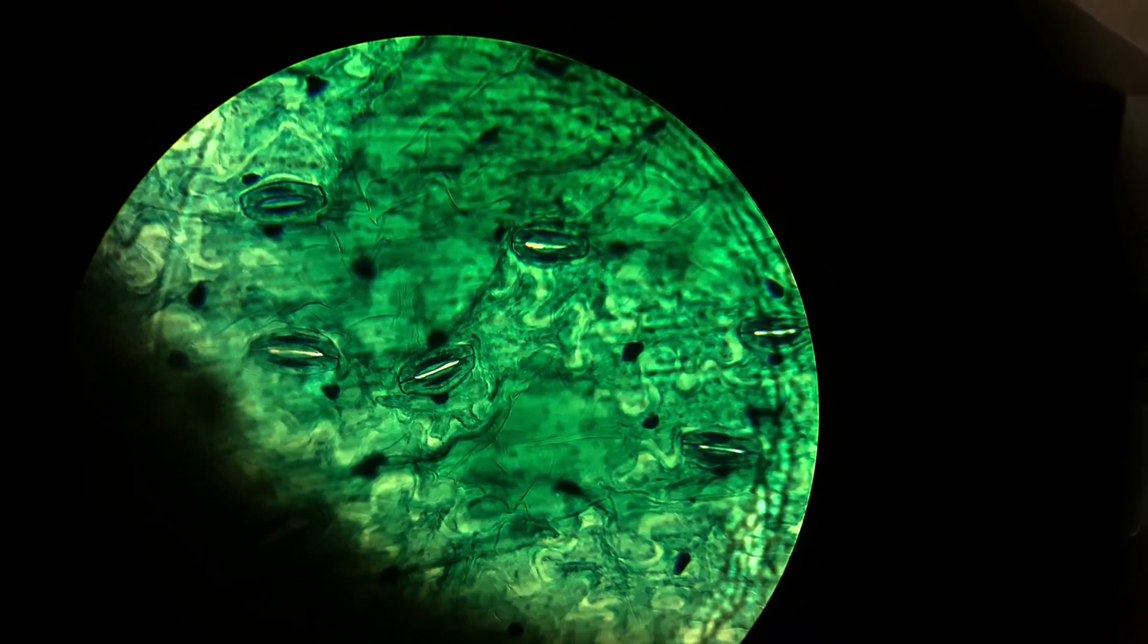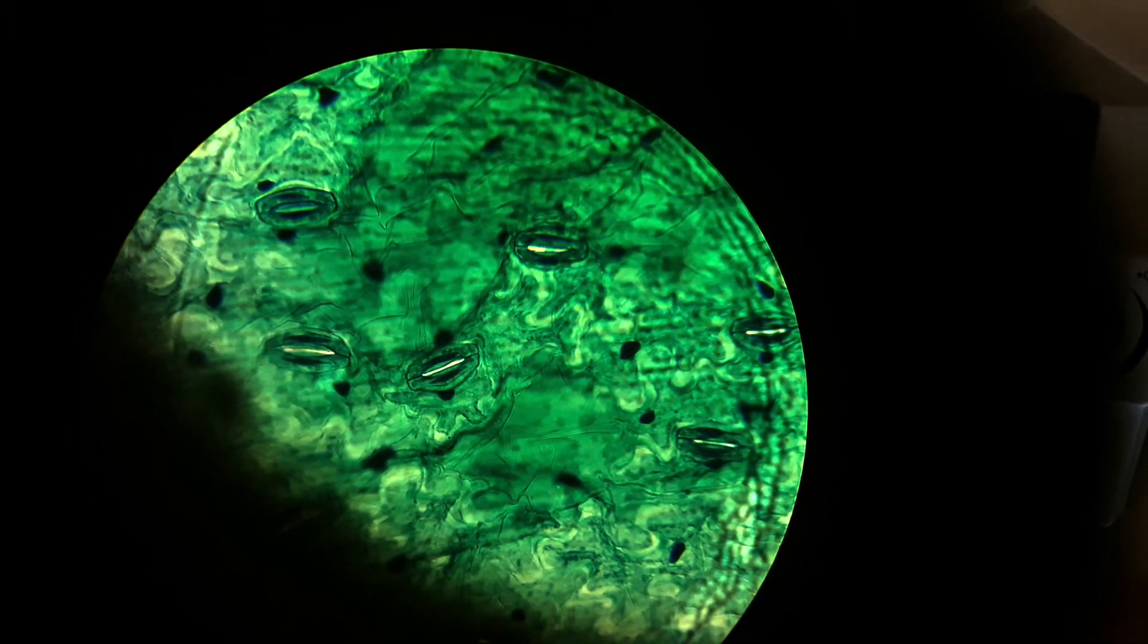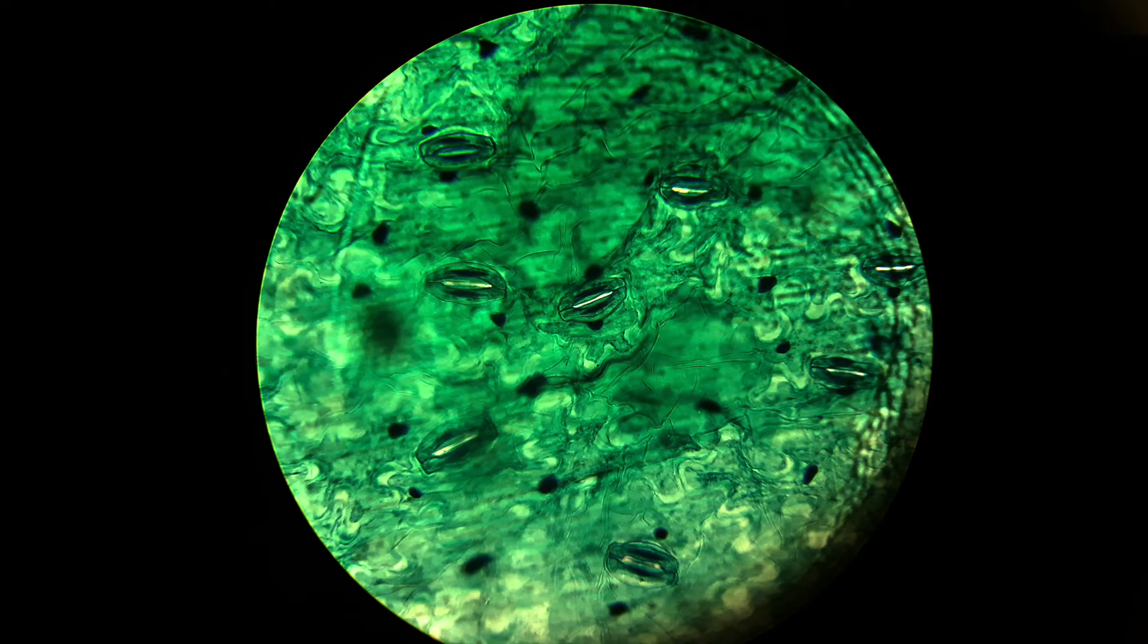Stomata play an important role in gaseous exchange and photosynthesis. They control the transpiration rate by opening and closing. It also helps in transpiration and removal of excess water in the form of water vapor. The stomatal closure at night prevents water from escaping through pores. It maintains the moisture balance according to weather by opening and closing.